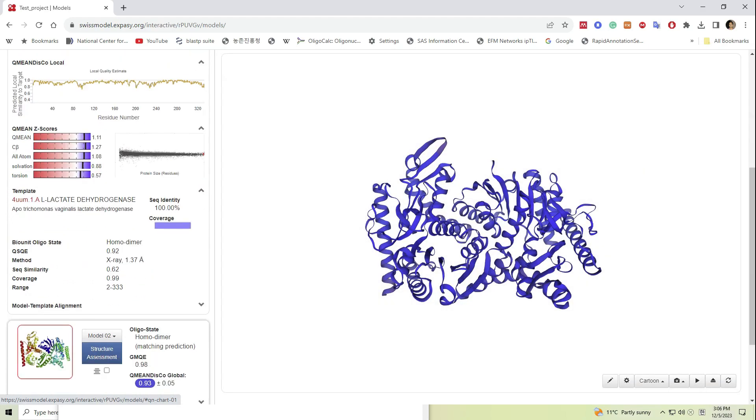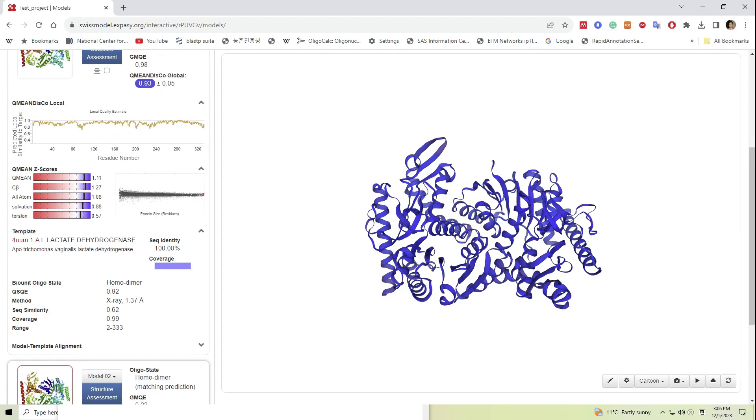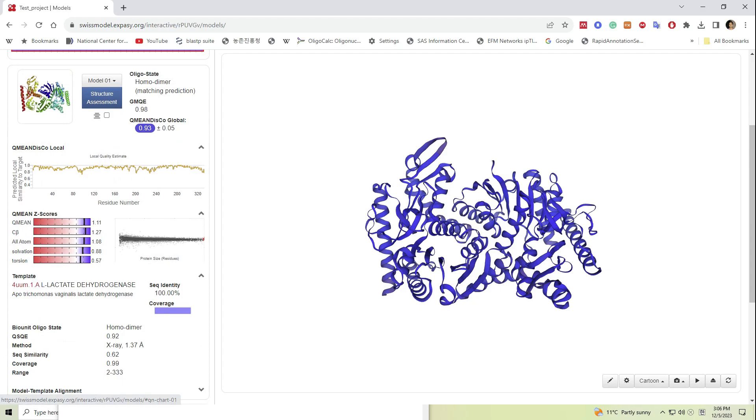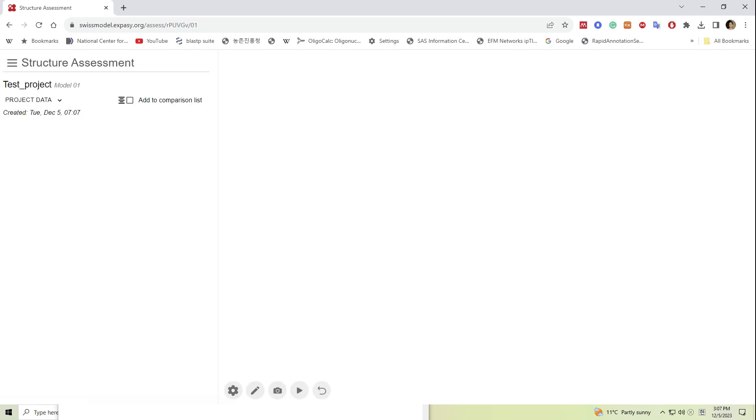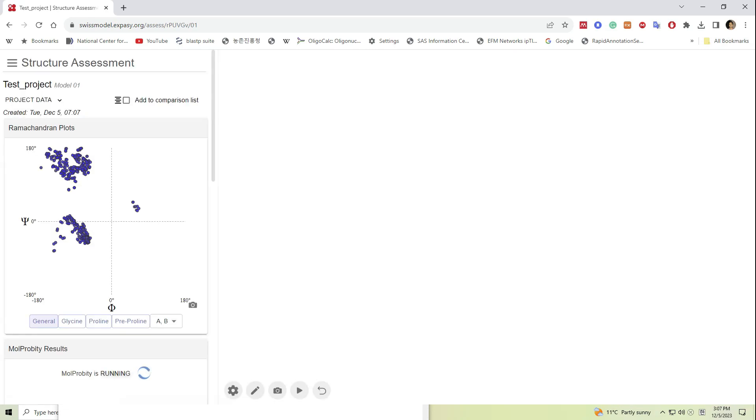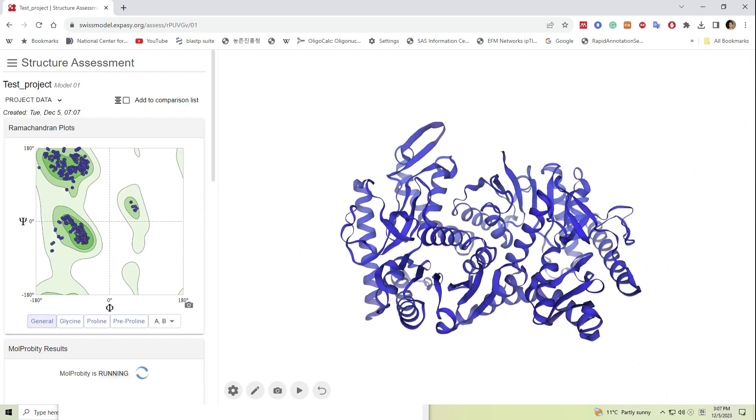Now if we click on the structure assessment, we can visualize the Ramachandran plot. Ramachandran plot demonstrates the dihedral angles of each amino acid.